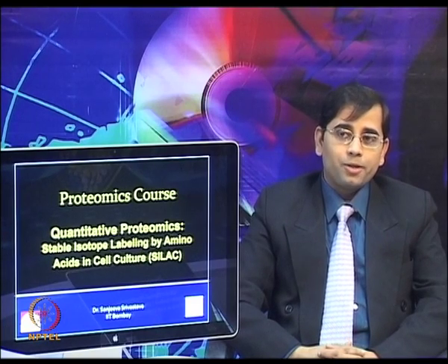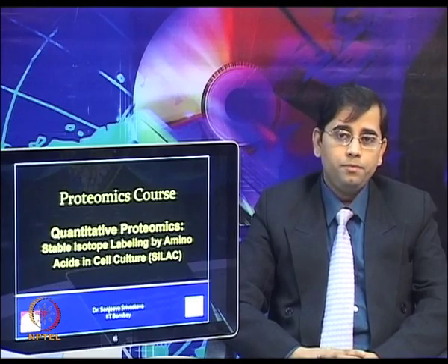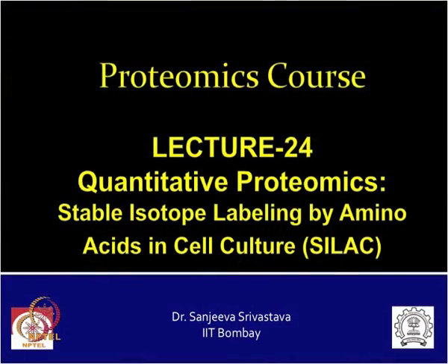Welcome to the Proteomics course. In today's lecture, we will talk about Quantitative Proteomics, the stable isotope labeling by amino acids in cell culture, SILAC.